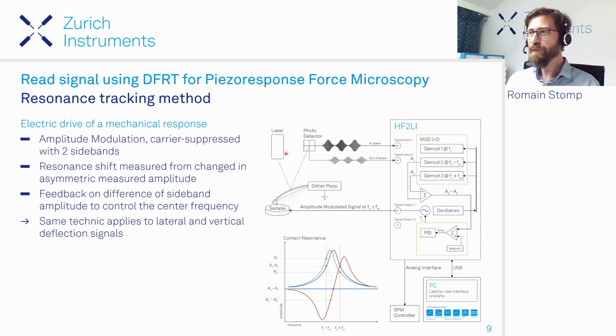So amplitude modulation is basically what you see here. You have inside the carrier, and this carrier will typically be your cantilever oscillating. And on top of that, you have the envelope that is modulated of this carrier on the two sides. So you have actually three terms. You have this frequency inside, you have this frequency up, and then you have this frequency down. So you have these two sidebands, and that's what you see now.